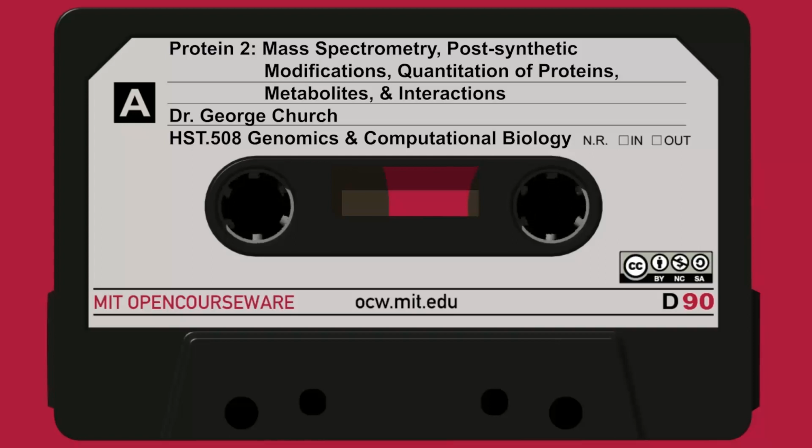charge and its mass. And here is shown a plot of calculated charge or isoelectric point in pH units, P being negative logarithm of the hydrogen ion concentration. So it's calculated on the horizontal axis and observed on the vertical axis. And what we're seeing here is if there were a perfect x equals y relationship, where calculated and observed were the same, then all the dots would lie on this line.